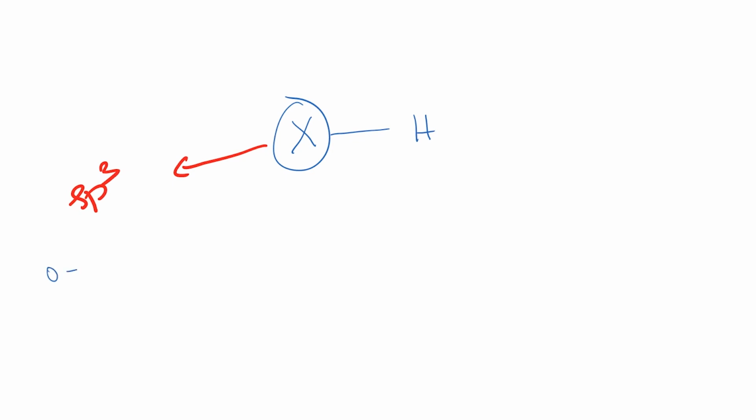So, if the hydrogen is connected to a group X, okay, and if this X is, I mean this carbon, I am talking about a carbon, if this carbon is sp3 hybridized, then you have a fairly reasonable idea that it will show up between 0 and 3 ppm. Okay.